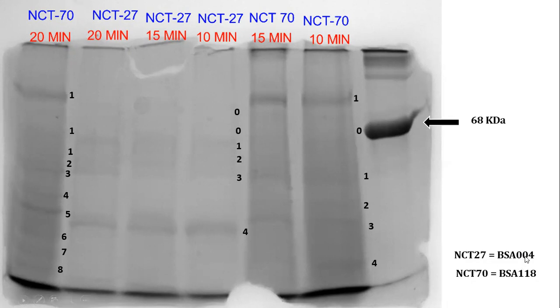They do not have any band which is equal to 68 kDa. That is why it is second zero. And they have four bands below 68 kDa. That's why 004. So by comparing, usually gel pictures can be compared visually, or you can give BSA numbers, and based on BSA numbers, you can also determine the uniqueness of species.